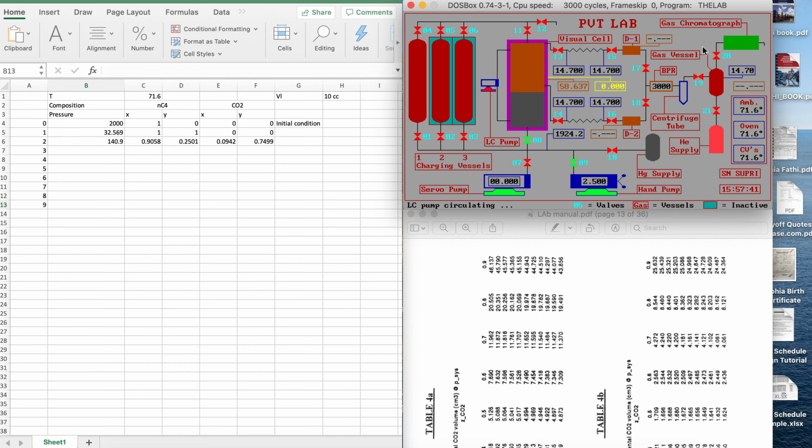I'm going to shake that. Still, I need to remove, so this time I'm going to remove 2 cc's. Seems that now the mixture is more compressible, so it can basically expand more. So I shake it.